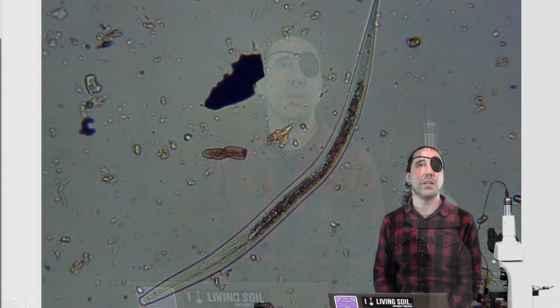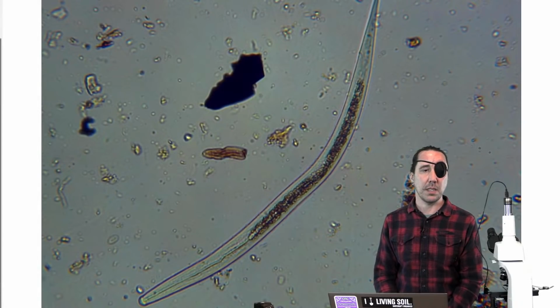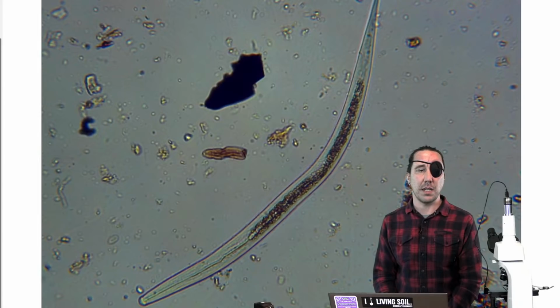Other than that, if you want, can you transfer over to the nematode picture on his camera? Dan had brought up the picture of a nematode so that you guys, is that a video? Video. Okay. I checked the date though, and I wanted to make it clear that this was about a year ago.